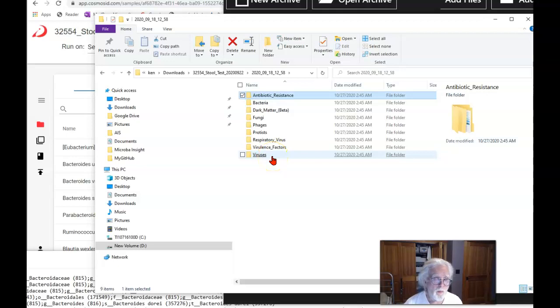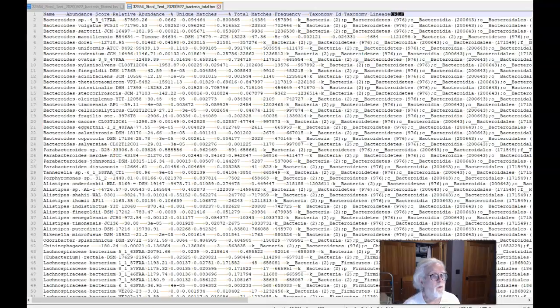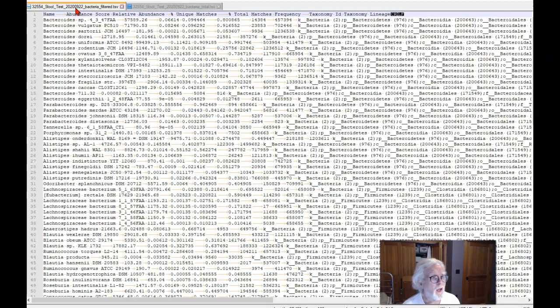Right now, Microbiome Prescription is set up only for bacteria, so if you click bacteria and you go down, you end up having a choice of one of two things: the bacteria filter or the bacteria total. Now, it is absolutely unclear which one is the better, but let's take a look at what's in each one of them. If you open up, you can inspect the information, and this is the bacteria total and the filter.